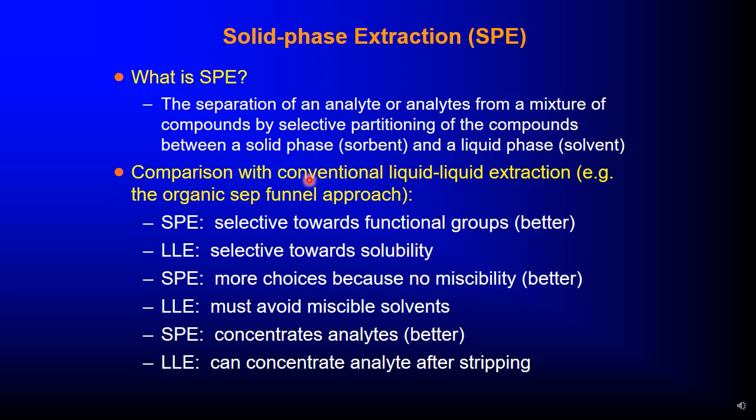Comparison between conventional liquid extraction and solid phase extraction: solid phase extraction is selective towards functional groups, while liquid extraction is selective towards solubility.